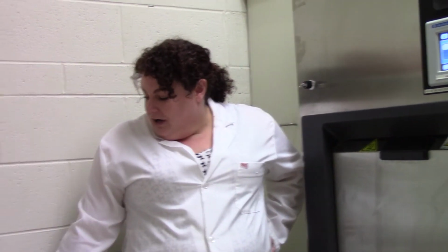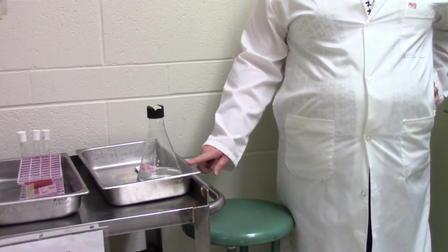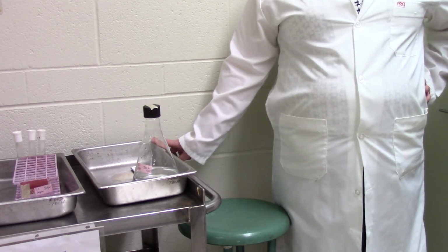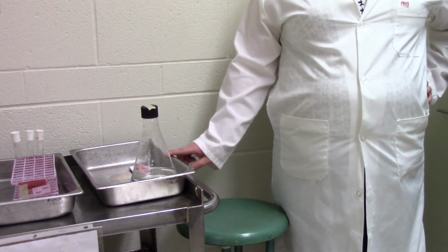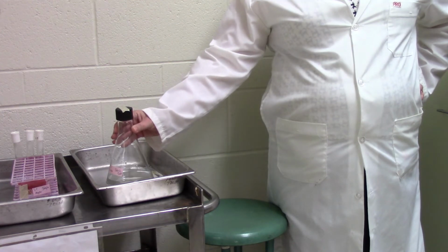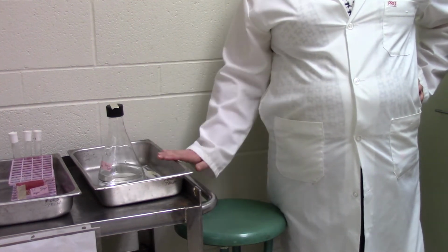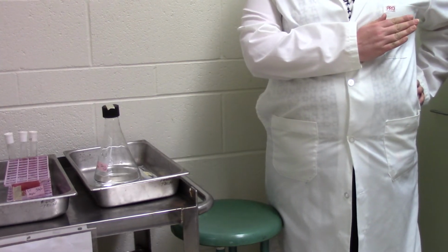So when we have our items here, these are ready to go, and the great thing about these silver trays that are out here is they are also safe to autoclave. It's often a good idea to put any liquids onto a tray like this so that if they do boil over, they just boil over into the tray and not into the autoclave itself.